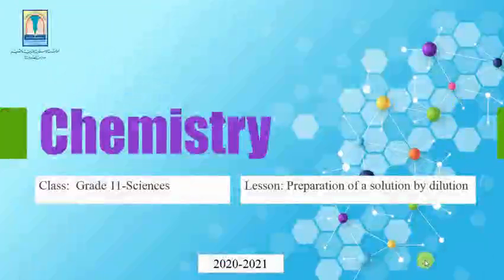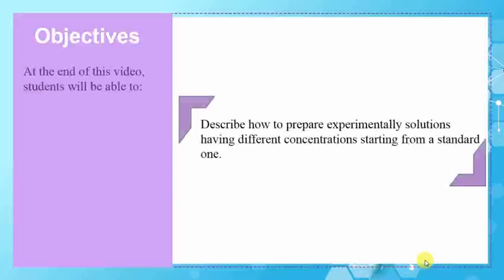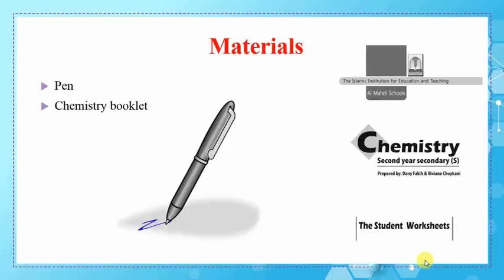Students, Assalamu alaikum. Our lesson is about the preparation of a solution by dilution. At the end of this video, you will be able to describe how to prepare experimentally solutions having different concentrations starting from a standard one. Please prepare your pen and your chemistry booklet.